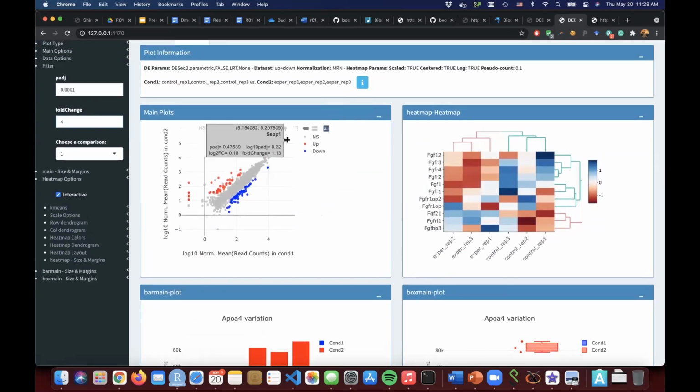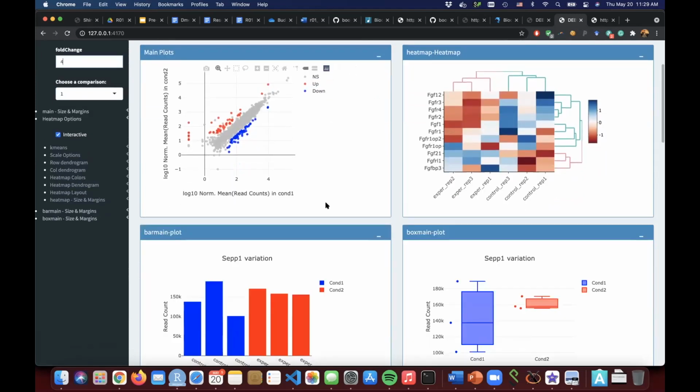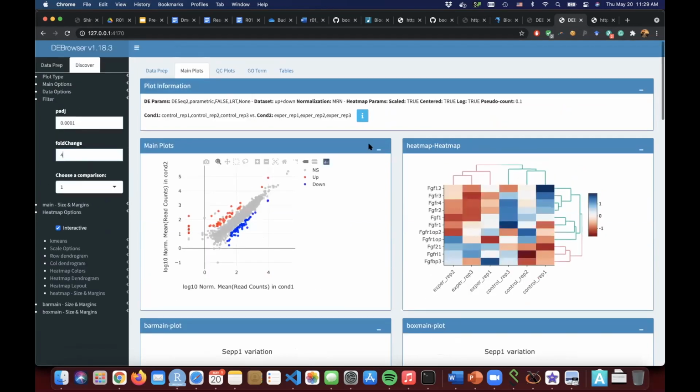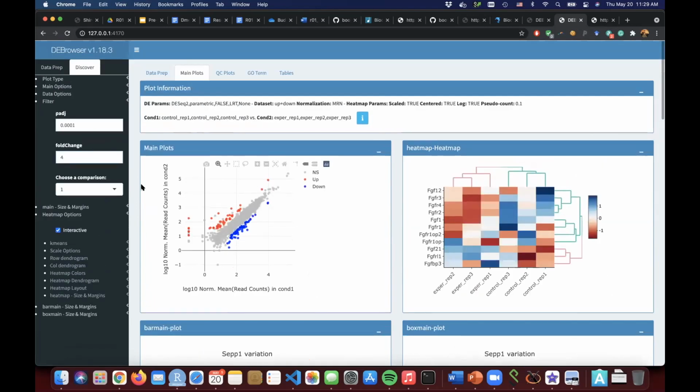So these are not significant there on top, but the numbers are huge, 150K. You can see the variation here is huge. Okay, this is what I was talking about, the variation. When you calculate the variance, if this is varied a lot, that variance number is higher. So this is what I was talking about.